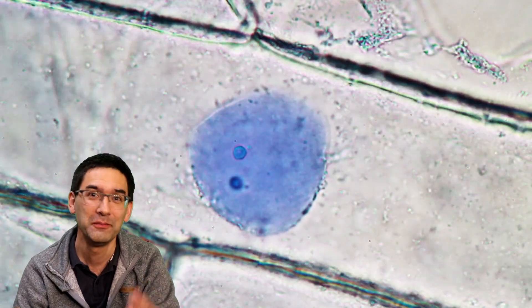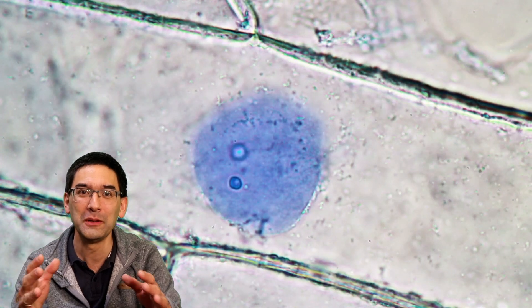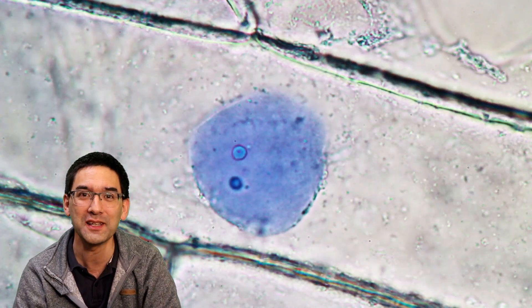I did not have to repeat the procedure several times to get these results. It was quite foolproof as a method. We'll be looking at a few more of these cells now.